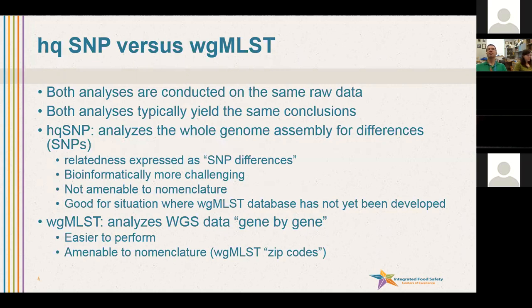Whole genome MLST, on the other hand, analyzes data gene by gene. It's easier to perform, and it provides you with an easy nomenclature that some people call the whole genome MLST addresses or zip codes, and I'm going to show you some examples of that.